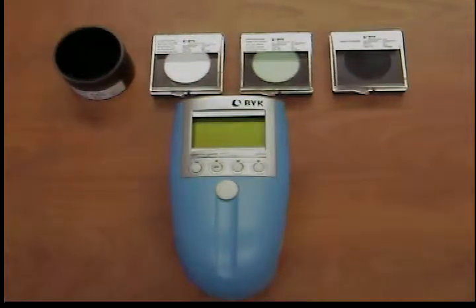To perform the gloss calibration, the instrument is further equipped with a high-gloss standard. All standards are manufactured from highly stable materials. When performing calibration, it is especially important to ensure that the standard is clean, the instrument lies completely within the diaphragm on the standard, and you set the instrument on the standard properly.